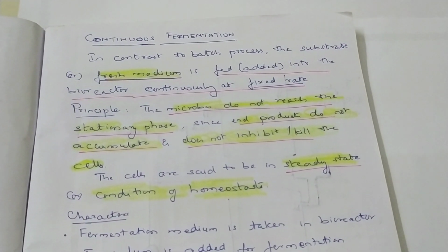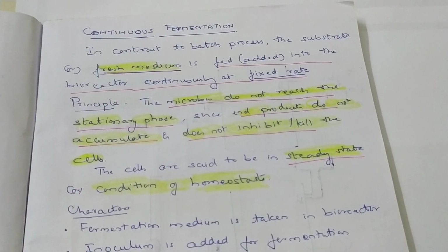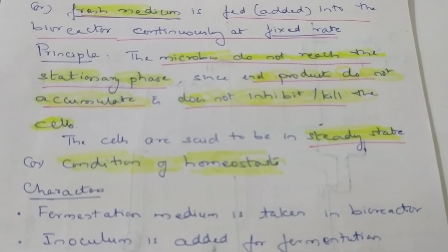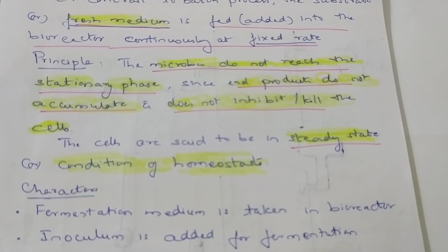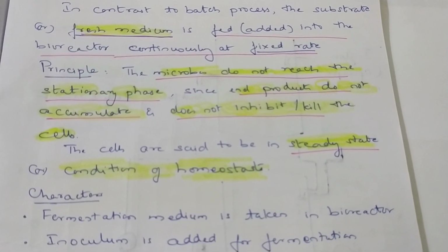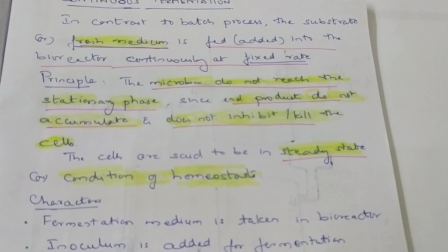So there is no intermittent complete harvesting of the media. Partial harvesting of the media will happen. The microbes do not reach the stationary phase since end products do not accumulate, and do not inhibit or kill the cells. The cells are said to be in steady state and the condition of homeostasis. So what do you understand here? The cells are remaining in one phase.